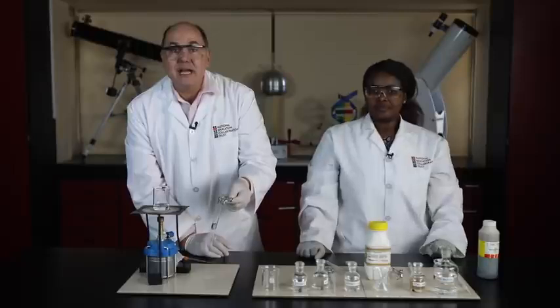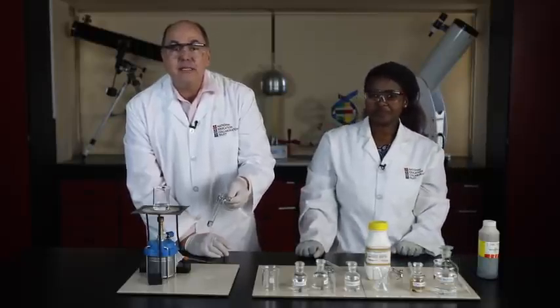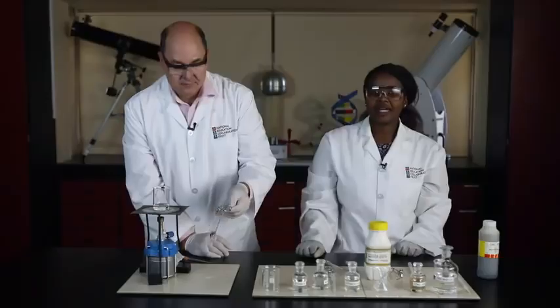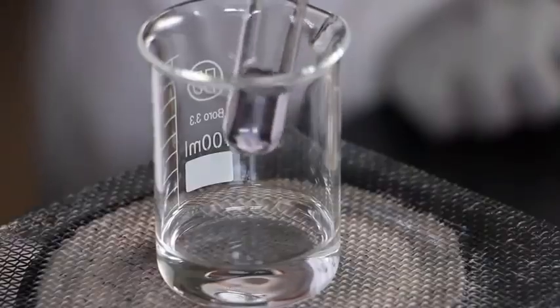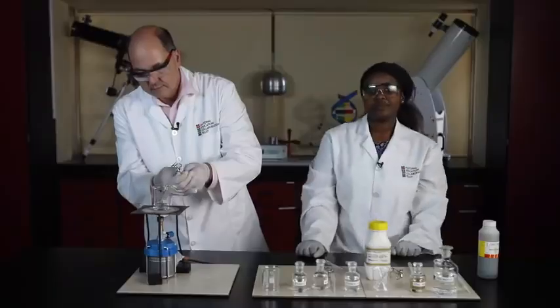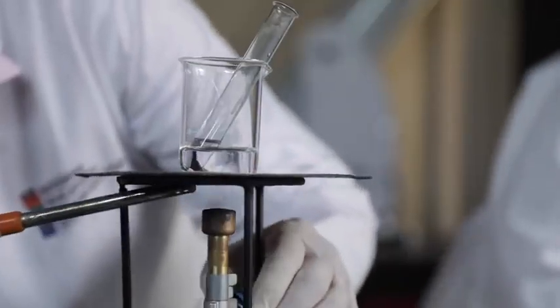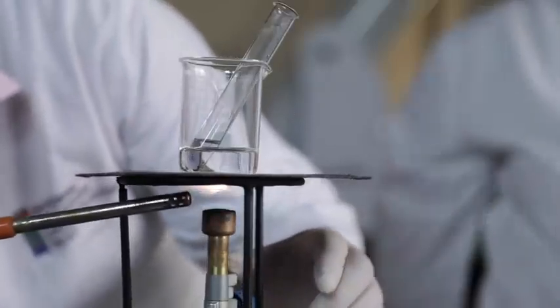Sulfuric acid heats up when we add it to other liquids like alcohol or acid. The increase in temperature helps speed up the reaction rate. Right. The water bath is ready. John, please put the test tube in the water and let's heat the mixture. Now we're lighting the Bunsen burner. And there we go.